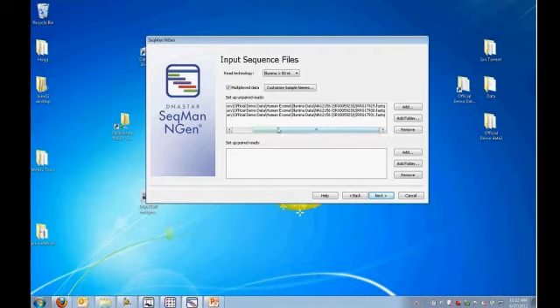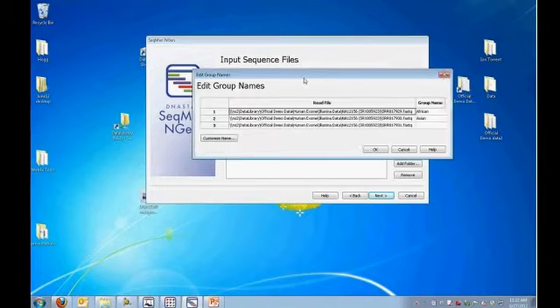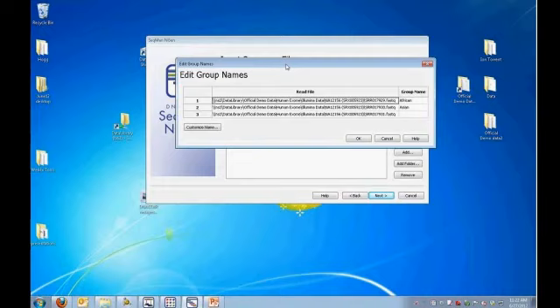This particular alignment is going to be a multiplex. So these are 3 different samples. And I check this box, and this gives us an interface now where we can type in and define what our different samples are. And so now I have an African, Asian, and European group. I might have 100 different files here, or I might have several dozen. I can define the group name. I may have multiple FASTQ files per set or per sample. This interface allows me to customize it.